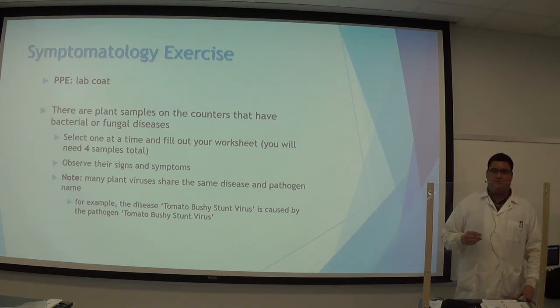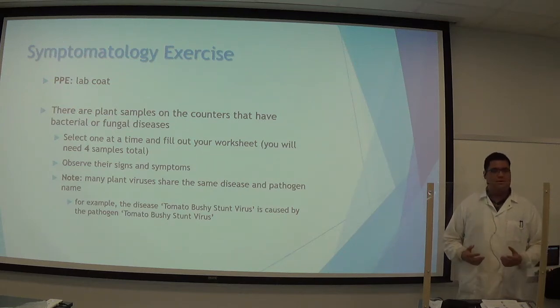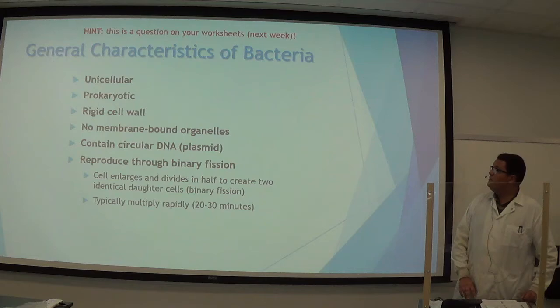So now that your plates have grown, we're going to isolate those bacteria or fungi by taking your inoculating loop and just touching. You don't have to rub the colonies, just simply touching the loop to the colony and then streaking another plate is enough to transfer it. And so we're going to try to be growing the microorganisms onto a new plate.